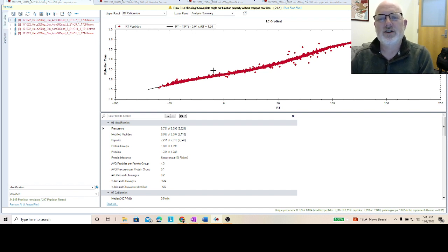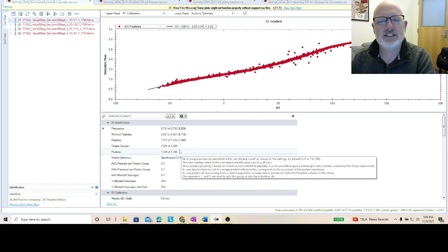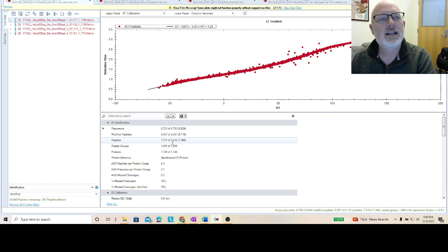Okay. So I searched it a couple different ways. I think 5 different ways. The first one will be what Spectronaut 17 is calling direct DIA plus. I haven't watched the videos yet, so I don't know what the difference is between direct DIA plus and old direct DIA. But this is direct DIA deep.